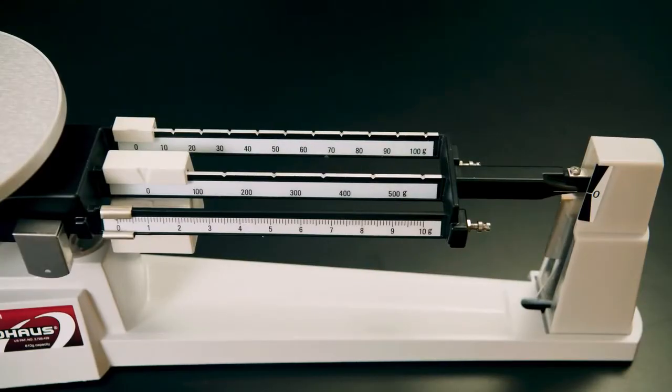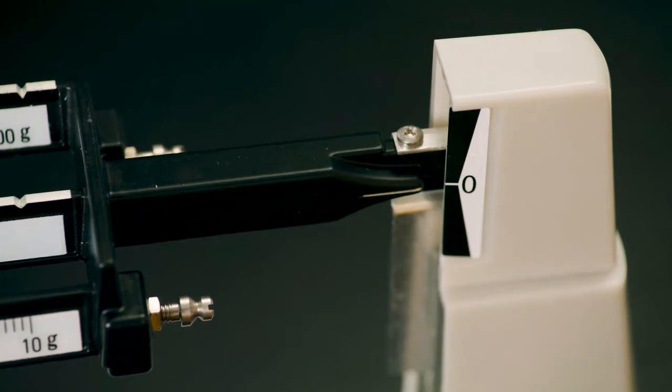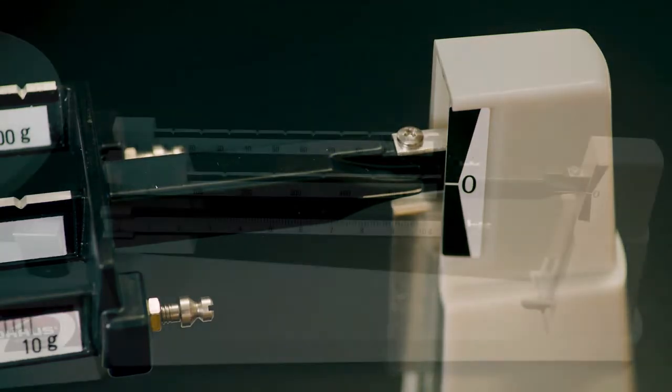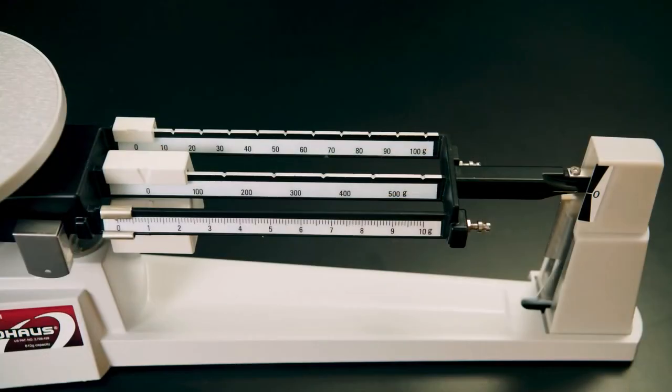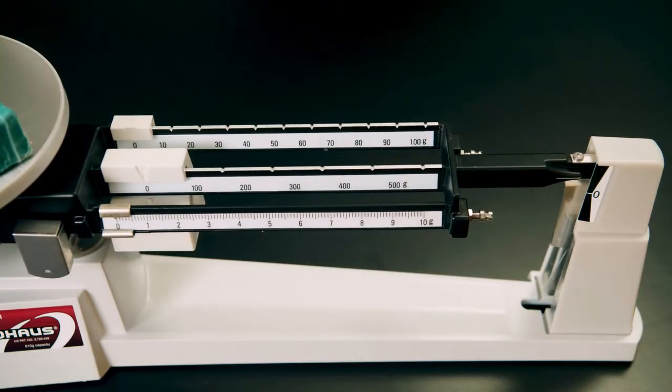Ensure that with no items on the balance and all the masses on the beams at 0, the pointer on the balance also reads 0. If it does not read 0, then the balance will need calibration. If the balance reads 0, then it's ready to use. Place the object that you need to mass on the pan. Move the mass on the beam that measures in the greatest increments first. In this case, the central beam measures in increments of 100 grams.